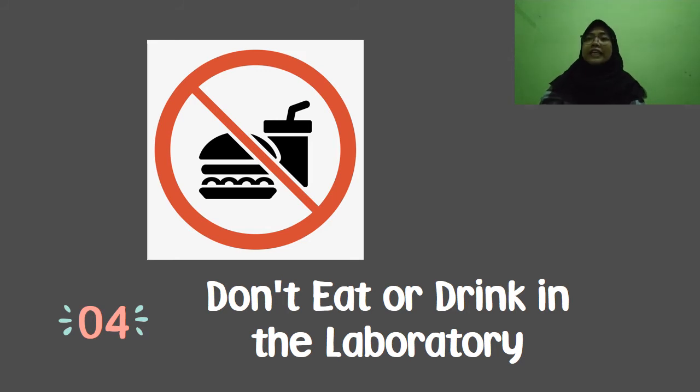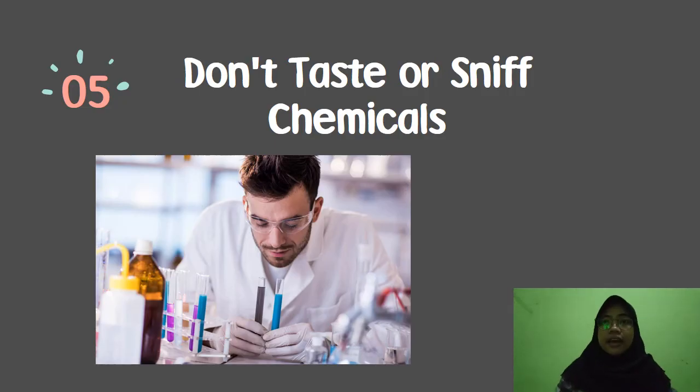Please don't ever eat or drink in the chemical laboratory. And don't ever store your food or beverage in the same refrigerator that contains experiments or chemicals. Tasting or smelling some chemicals can be dangerous or even deadly. The best way to know what's in the container is to label it. So you had better get in the habit of making a label for glassware before adding the chemicals.